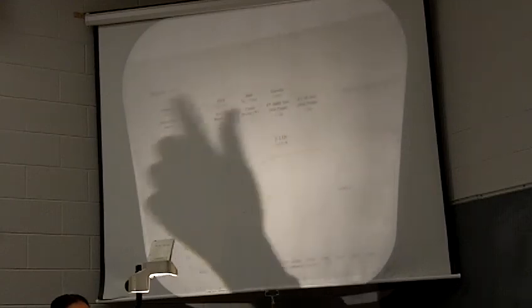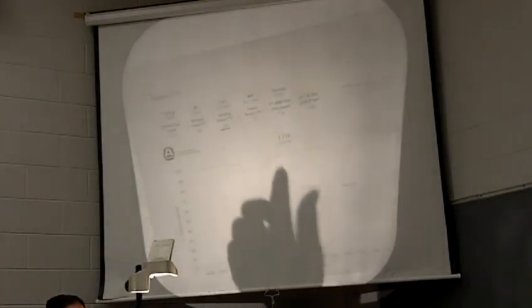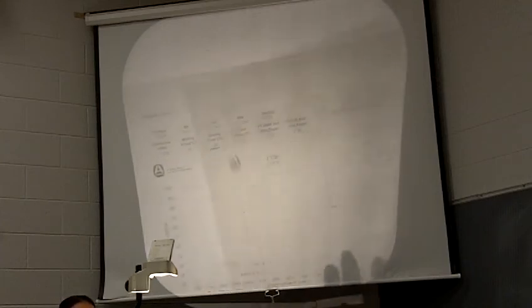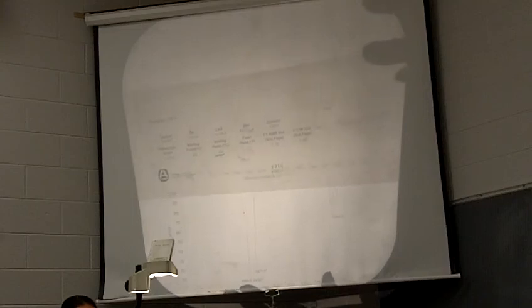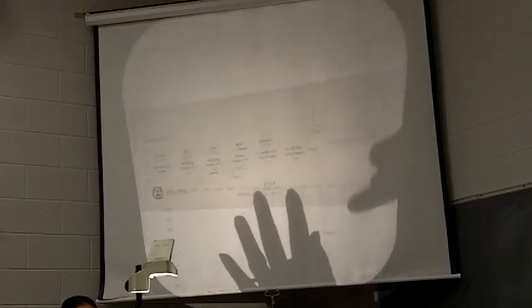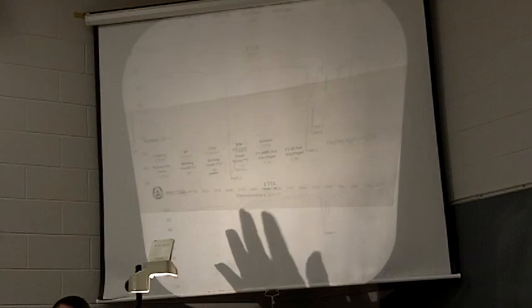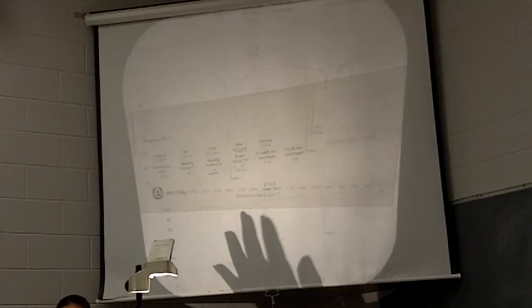Hexane, same thing, 6 carbons, sp3 CH, we've got our CH bending and our fingerprint region. The only way you can tell these two apart is by their fingerprint region. And so that's what you're going to be using to figure out your unknowns once you go to look things up. The fingerprint region of your IR spectrum should match the fingerprint region of what you say the unknown is, okay?